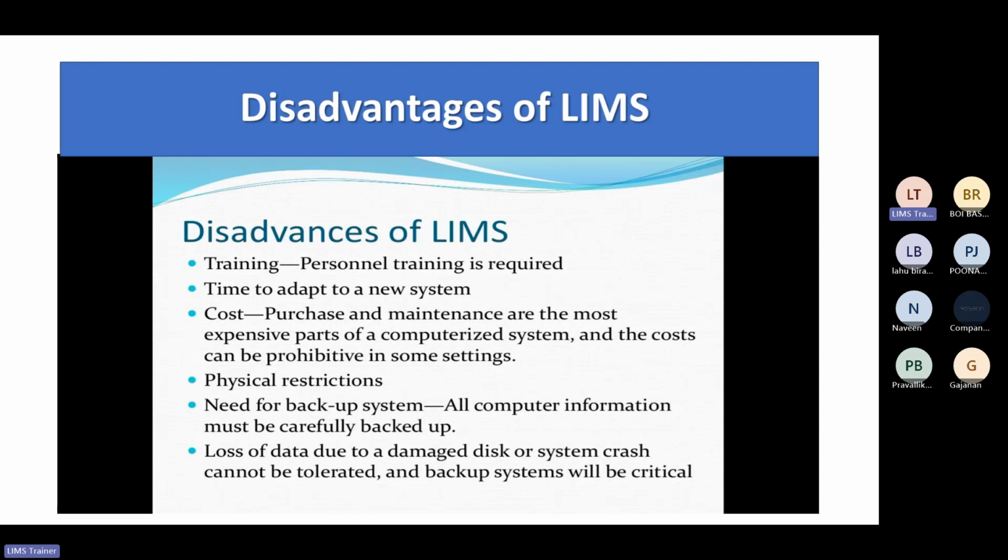Then there will be some time gap, as to adapt to the new system, time will be required. Suppose you implemented LIMS software in a laboratory. For smooth operation of that laboratory, it will take some time, because all the working persons have to understand how the software is responding and how they are generating the different tests and different reports. So to get that flow, it will take some time.